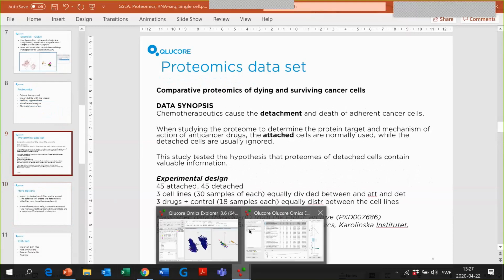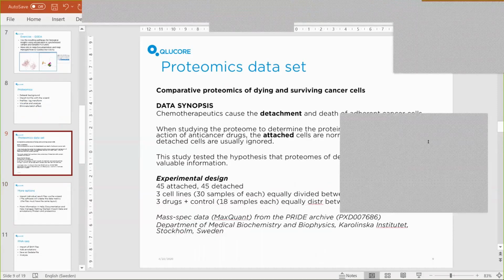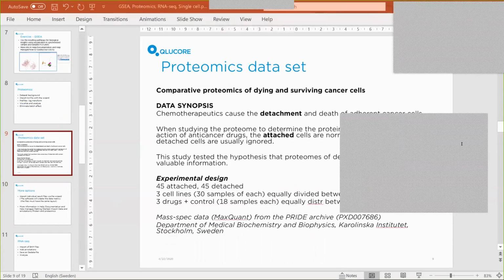Okay, maybe while I still have the GSEA open, I will have a look at this question that I got on that. The question is, the results shown include the expression value of the individual genes, right? So it's not just a present-absent representation of the genes, because we compared two groups.